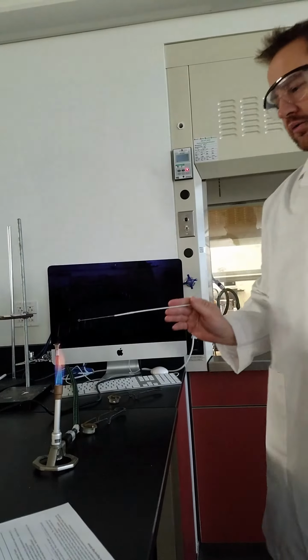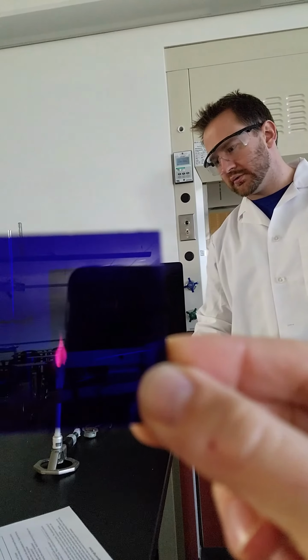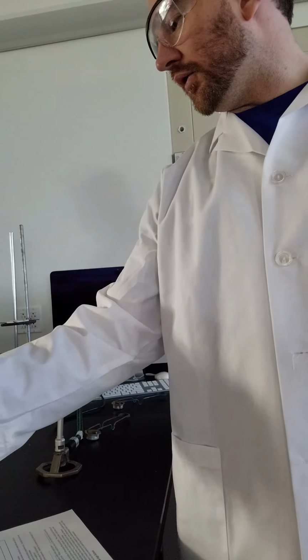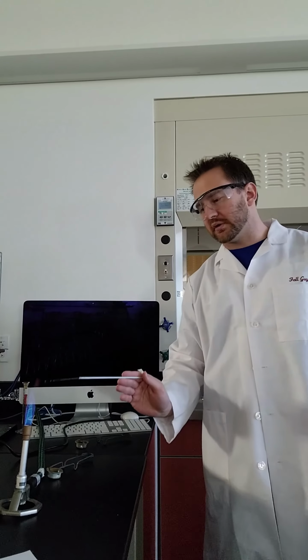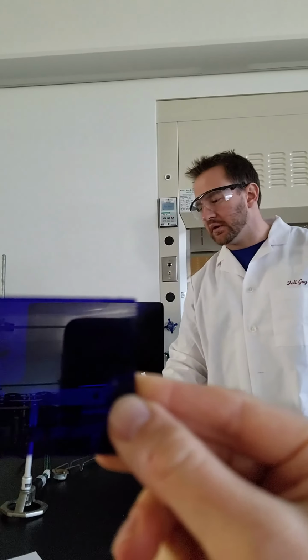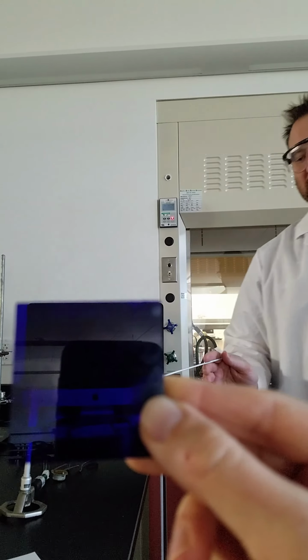Now we're going to look at potassium, quickly without the lens again, and now with the filter. And you can see that nice bright pink color. Now, when I show you the mixture of both sodium and potassium without the lens, you can see that it's a nice bright orange flame. With the cobalt lens, however, you can't actually see the emission from sodium. You can only see the emission from potassium. So it filters out those wavelengths emitted by the sodium.